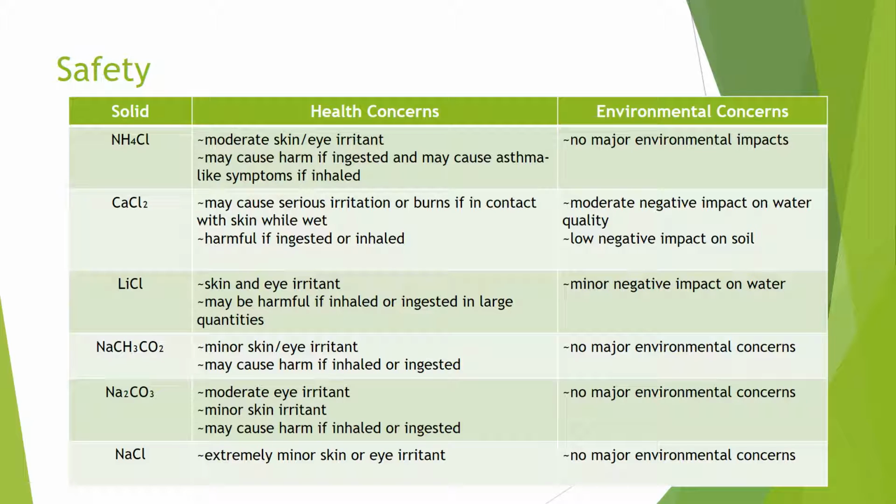The health concerns of lithium chloride are that it is a skin and eye irritant and may be harmful if inhaled or ingested in large quantities. The environmental concerns of lithium chloride are that it may have minor negative impacts on water. The health concerns of sodium acetate are that it is a minor skin and eye irritant and may cause harm if inhaled or ingested. There are no major environmental concerns of sodium acetate.